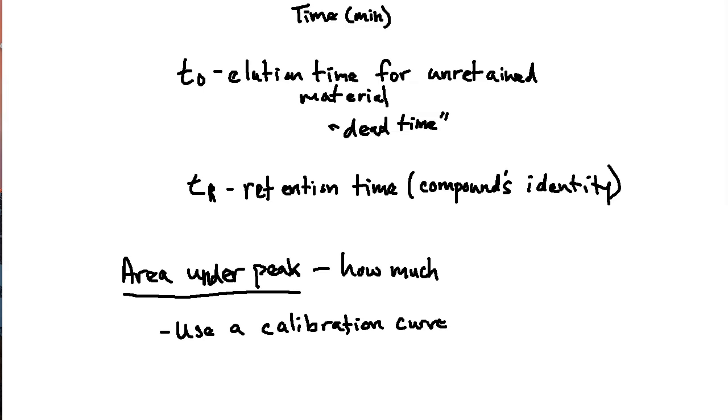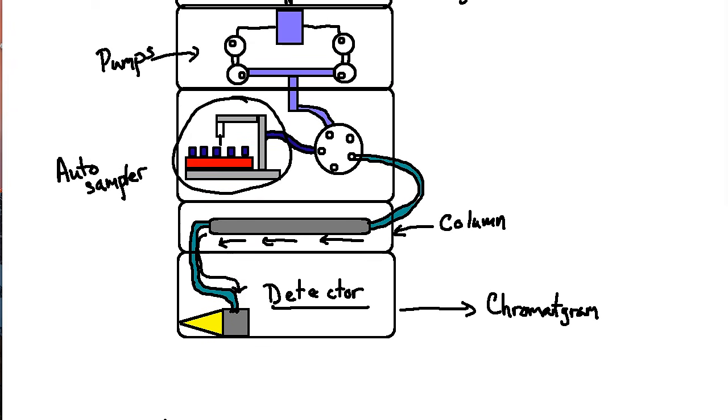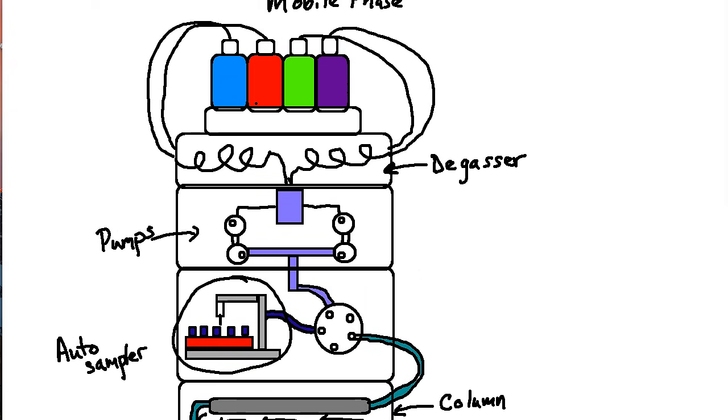All right, so we're closing in on half an hour. I think I'm going to wrap it up there in terms of the introduction to HPLC, and we will continue forward with these lessons and start to outline some more detailed parts to the HPLC, particularly the different types of phases that we can undergo, as well as some troubleshooting stuff. So what happens if all my peaks are too close together? How can I improve that? Things of that nature.